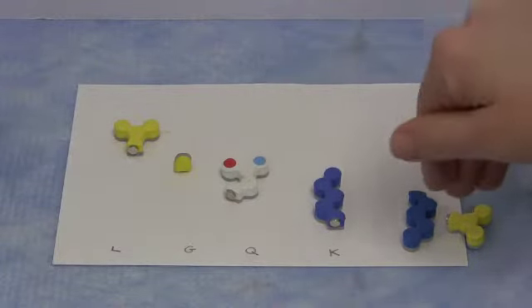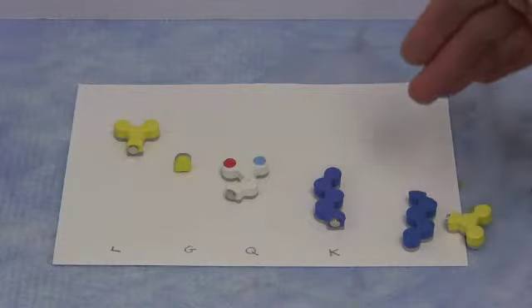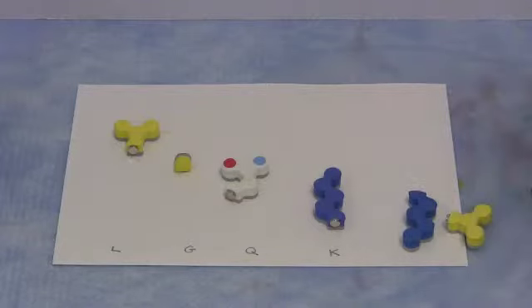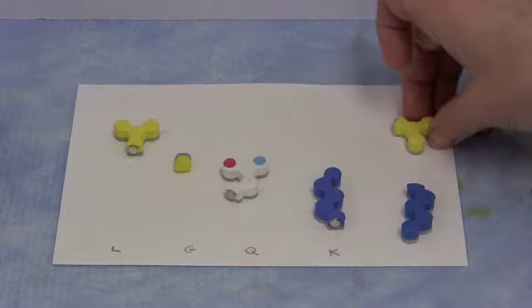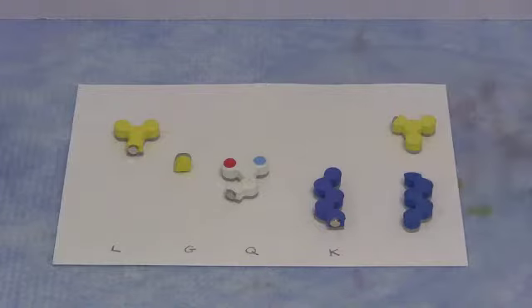Meanwhile, the same thing is happening to the mixture of amino acids in our dipeptide. So say, for the sake of argument, if it were leucine-lysine, then the leucine would move the same distance as the leucine standard, and the lysine would move the same distance as the lysine standard.